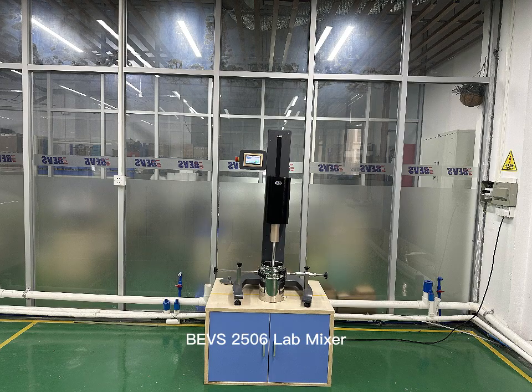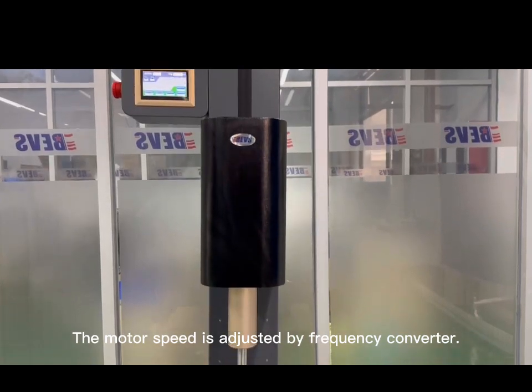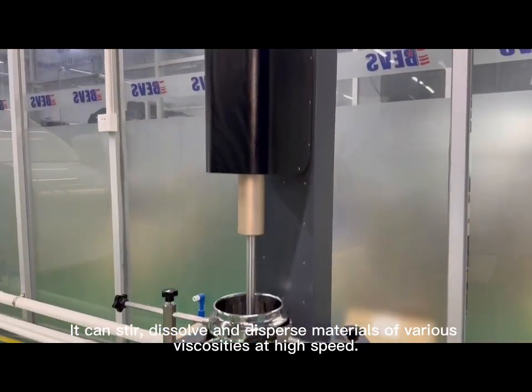BEVS 2506 Lab Mixer. The motor speed is adjusted by frequency converter. It can stir, dissolve, and disperse materials of various viscosities at high speed.